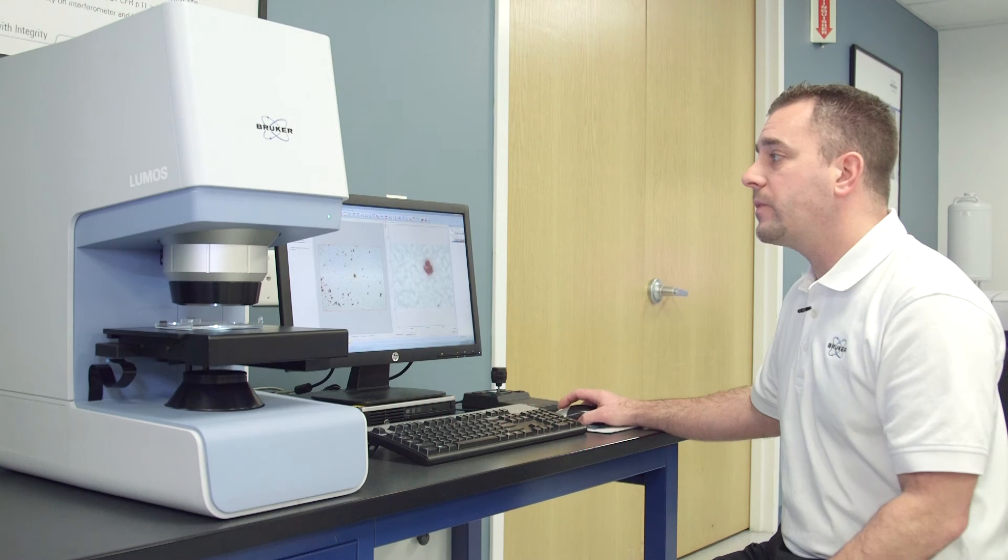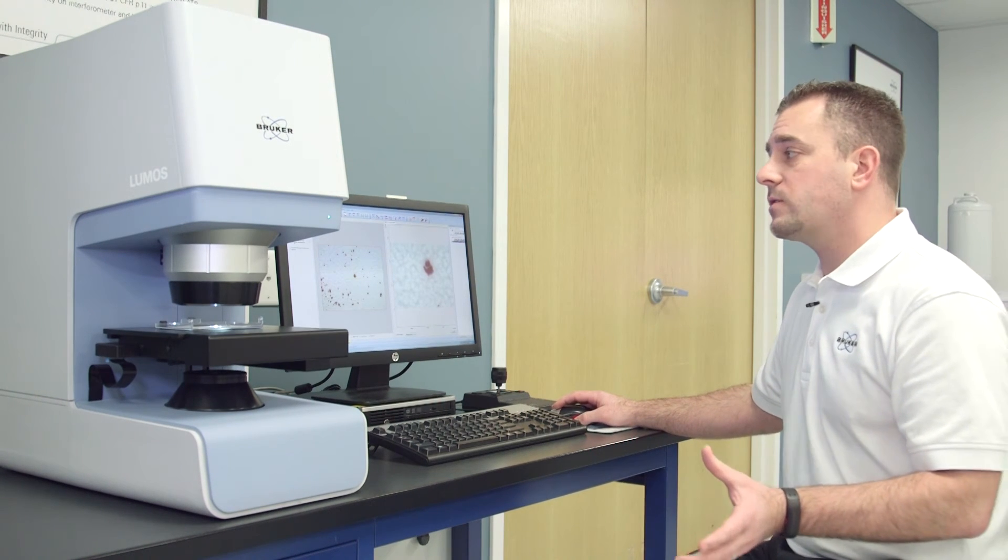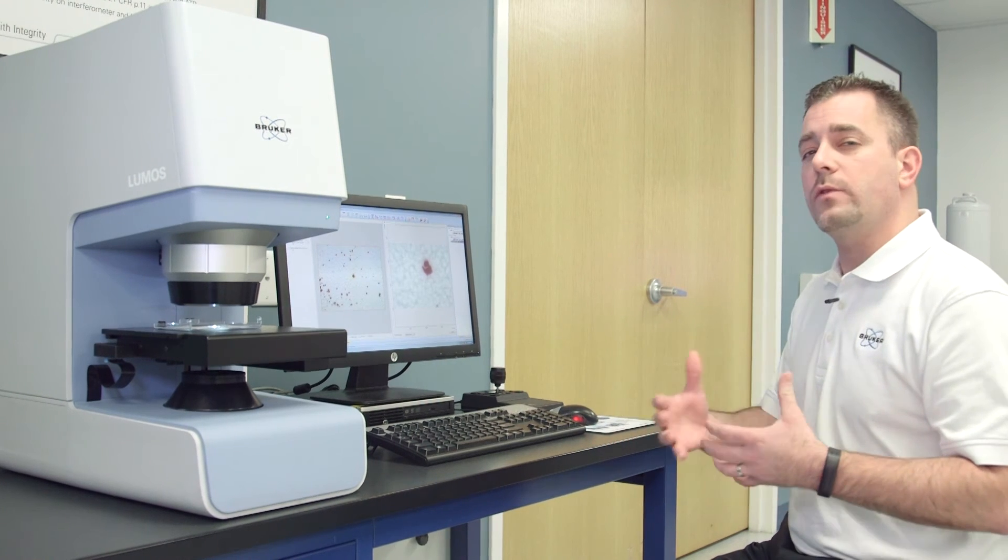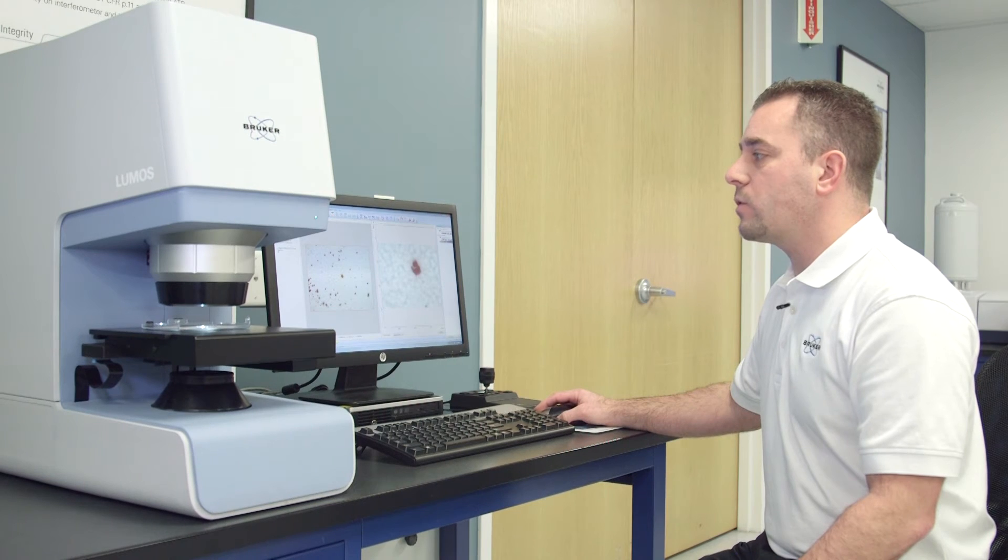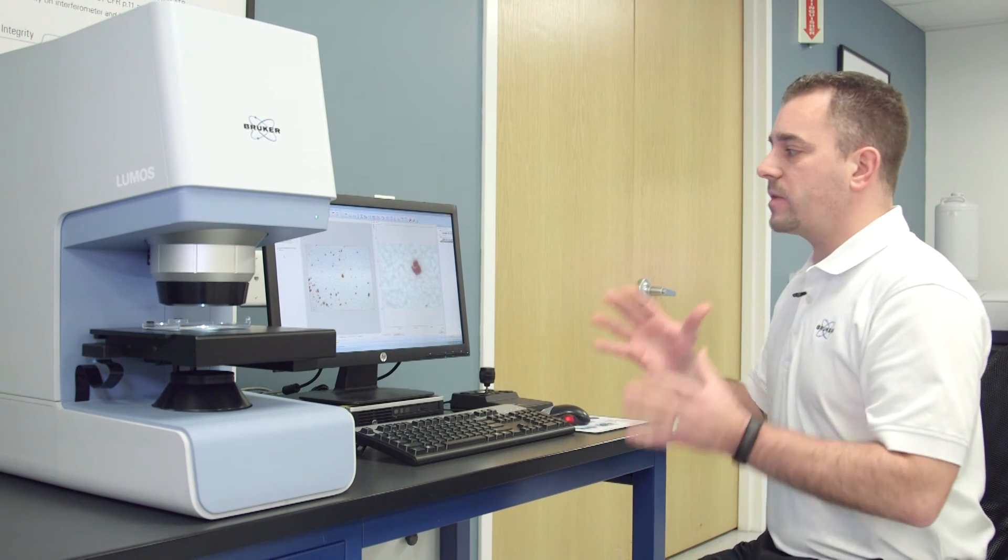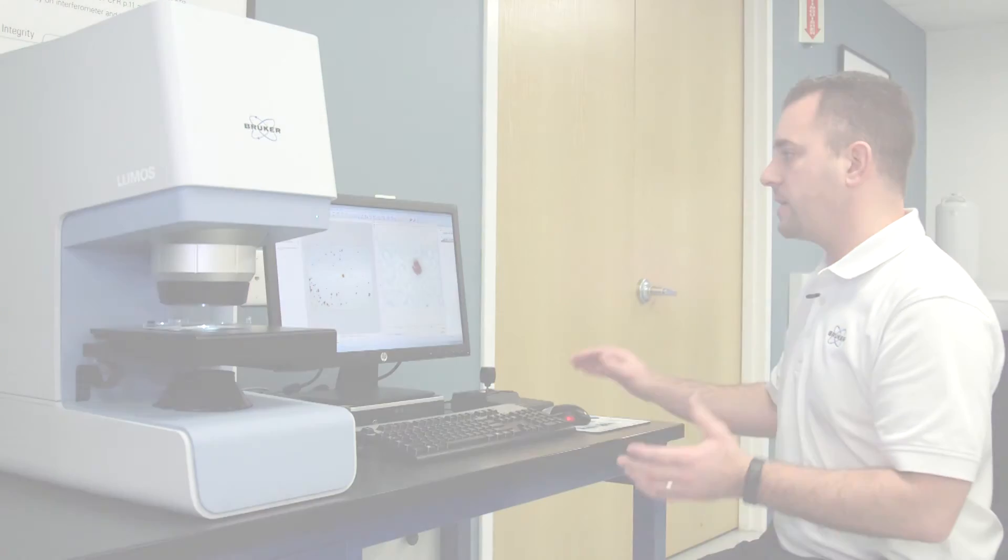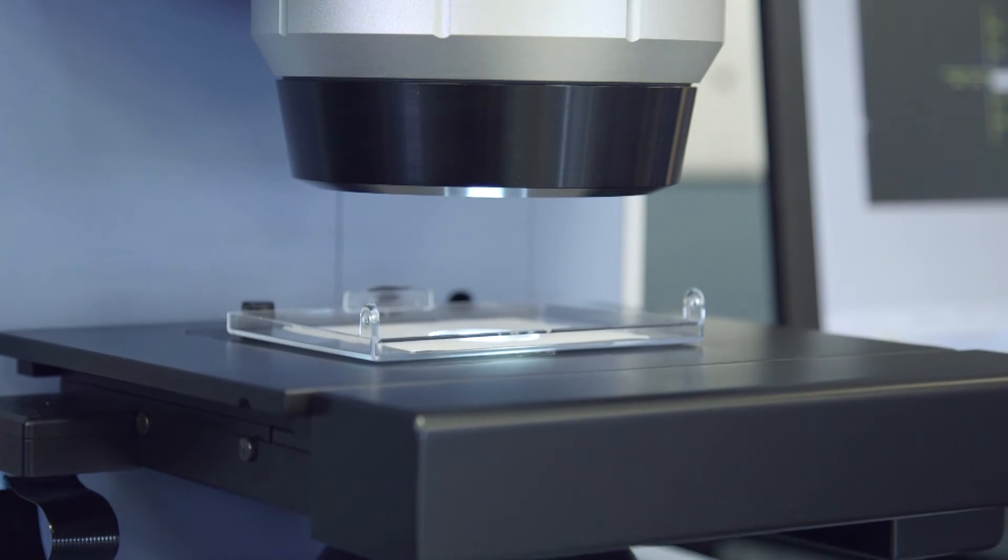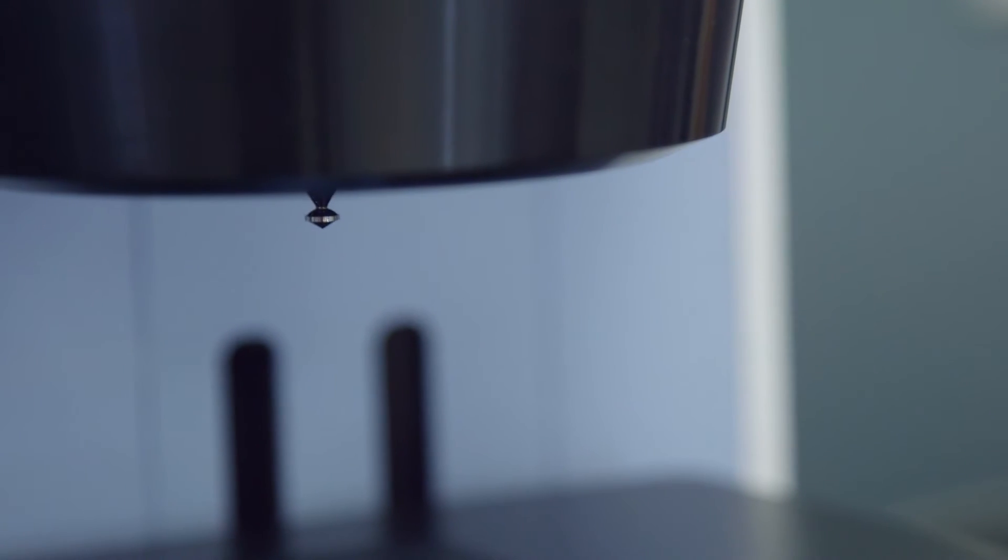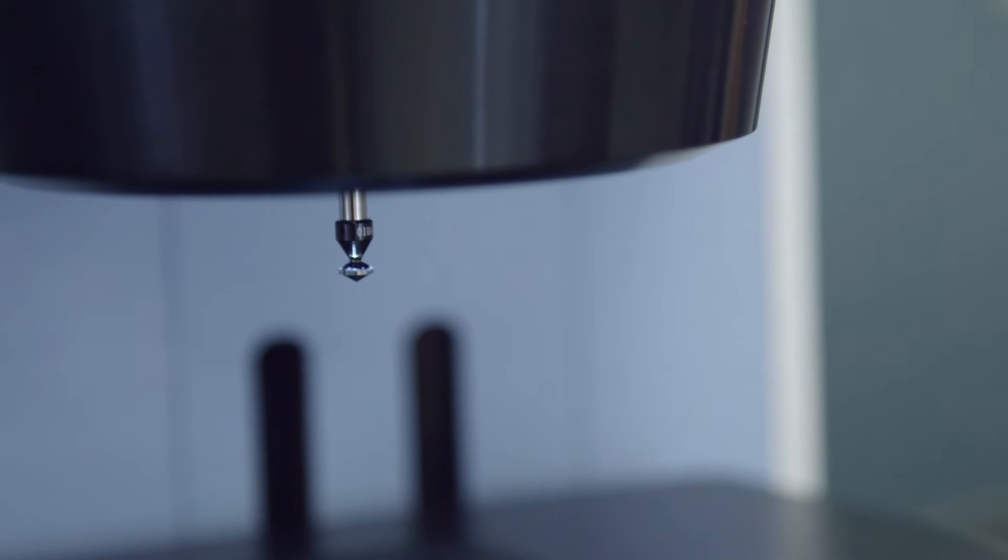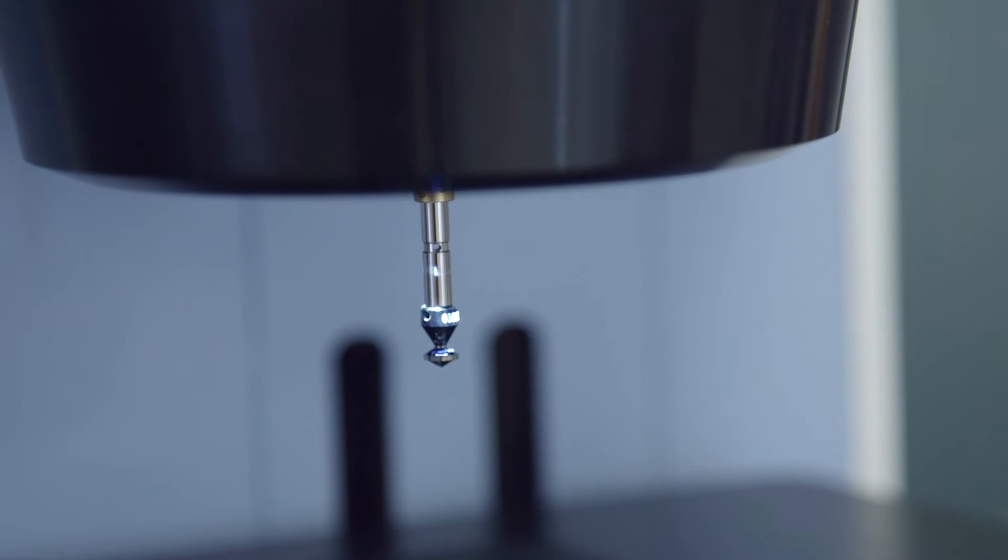Now this brings us to our background mode where we can choose an existing background, measure a background once, measure a background after so many times that would be more if you were doing a large mapping experiment or measure the background in a corner aperture. In this case I'm going to match my background aperture to the actual size of the particle to keep my baseline nice and flat. So now you can see the stage drops out of position and the ATR automatically driven down by encoded piezo motors, comes out and will take the background measurement automatically.